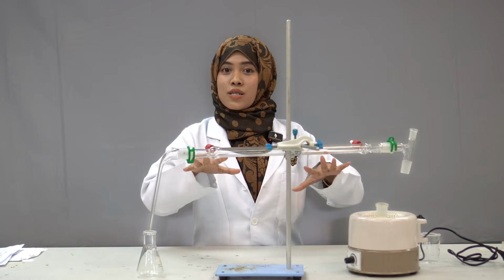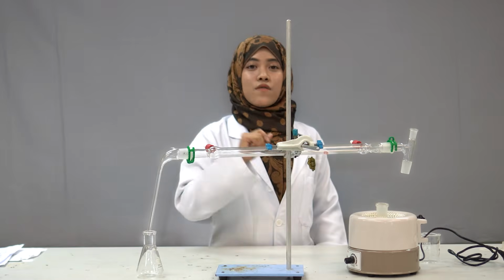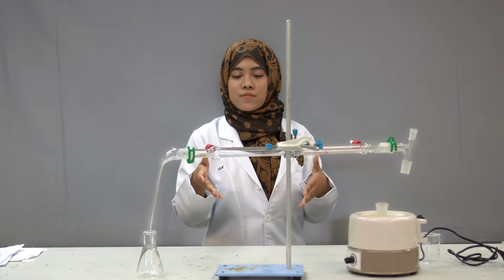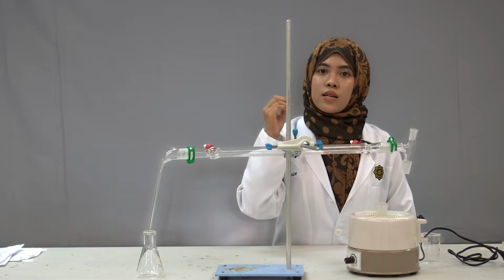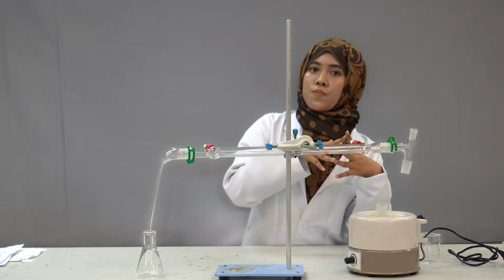So you may wonder, how does distillation work? It is a very simple principle based on the differences in boiling point. As we know, every substance has a unique boiling point. So in the mixture, each substance will vaporize at its own specific boiling point. If I have in this flask ethanol and water, your ethanol will vaporize first, and then the vapor will be cooled down and condensed back into its liquid form, and we can collect it in a separate receiving flask.